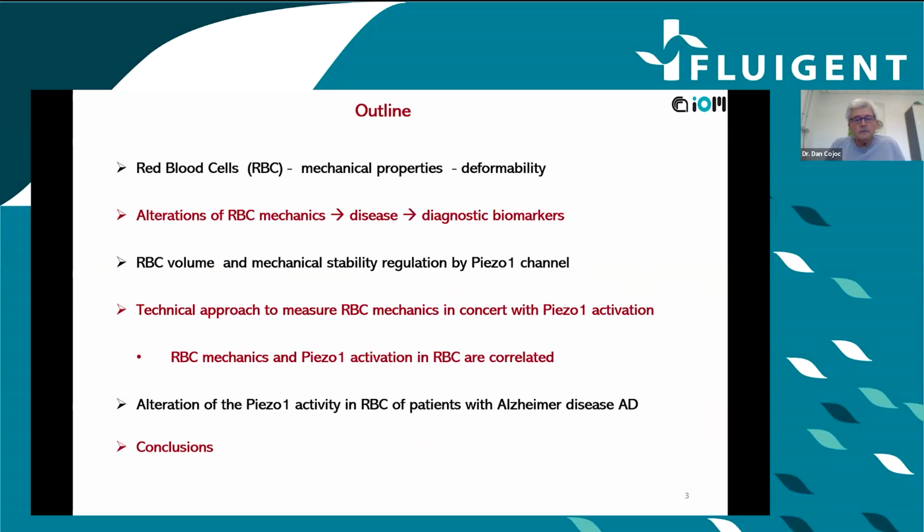Then how the red blood cell volume and mechanical stability are regulated by the Piezo channel. Then the technical approach that we apply to measure red blood cell mechanics in concert with Piezo-1 activation, so at the same time.